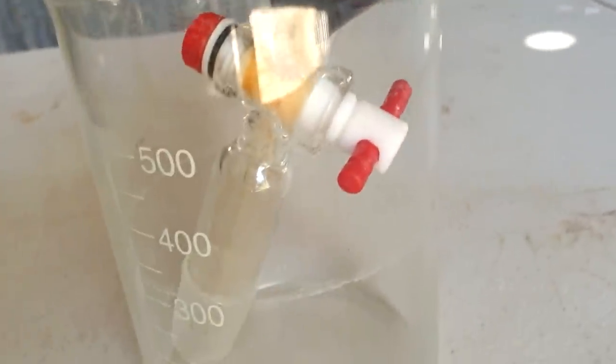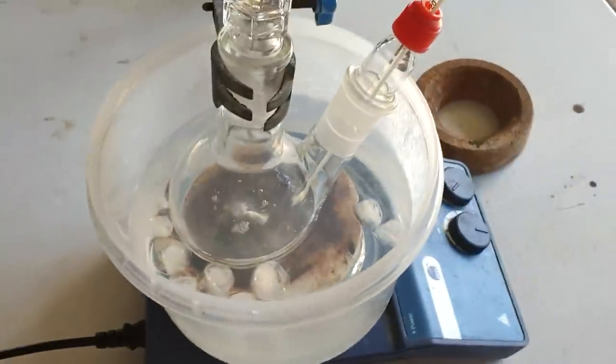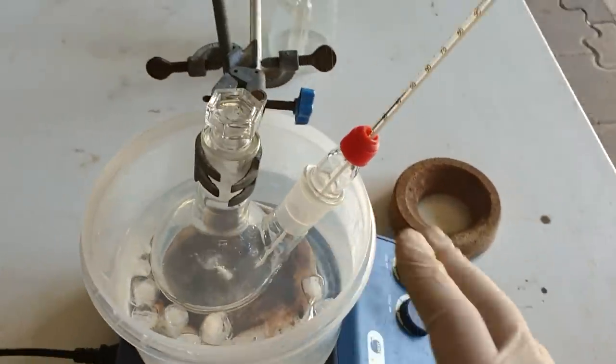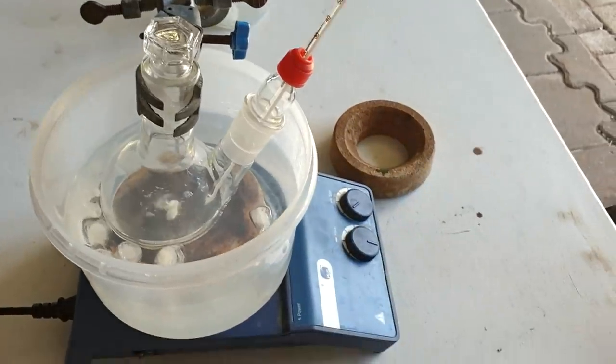Ready to go. That bromine's doing its best to be an escape artist, as it tends to do. We've got our DCM cyclopentanone ketal dioxane mixture here. It's cooling slightly. Temperature's really the difficult part of this reaction. Well, I haven't tried it before. This is what I'm thinking is the difficult part of the reaction, looking at this prep.